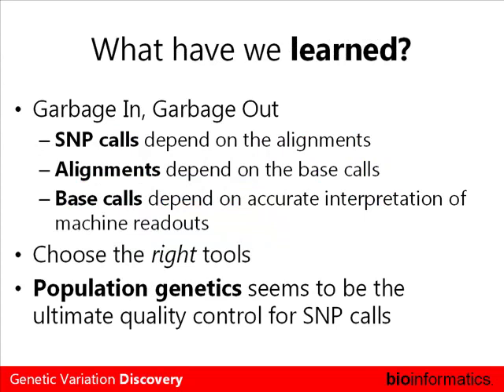So what have you learned today? Well, first of all, garbage in, garbage out. If you have a mistake already at the base calling, that's going to affect your alignments, and then it's going to affect your SNP calling. So it's essential that you try and keep everything as pristine as possible, use the highest accuracy possible. So that might be the only example where who cares about 5%? You know, when everything counts, that 5% might make the difference between good and bad calls. Because it's expensive to validate.